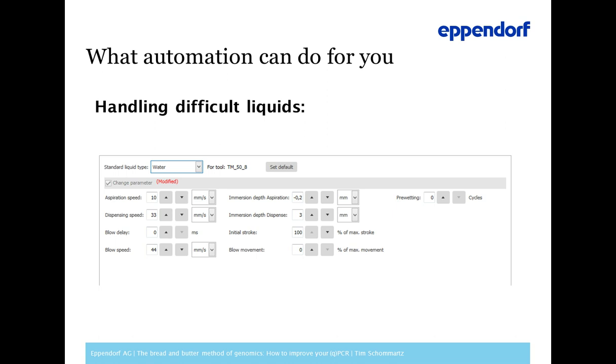So, and this is what I mentioned when I talked about PCR cyclers. It depends. There are some devices out there where you can only put one type of plate, so only non-skirted plates, let's say, right? And I would always prefer something which is independent of the shape of your plate.